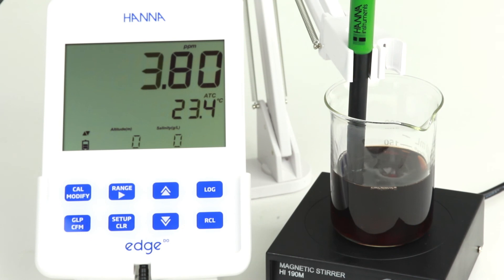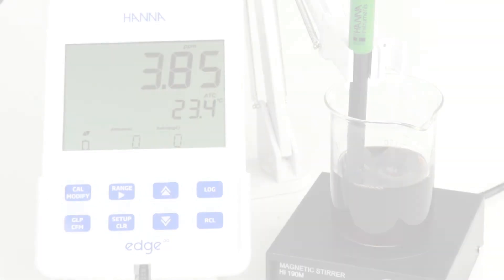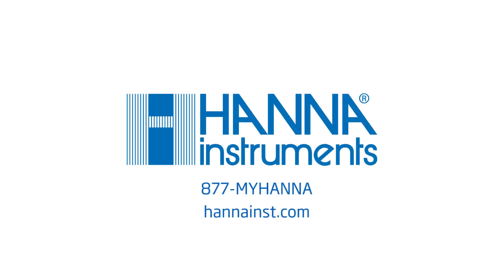Measurements are easy once the probe and calibration are complete. Simply submerge the probe into the sample while stirring gently until the reading is stable. A magnetic stirrer works best for this. We hope you have enjoyed this video. For more information, be sure to contact us or visit hannainst.com.